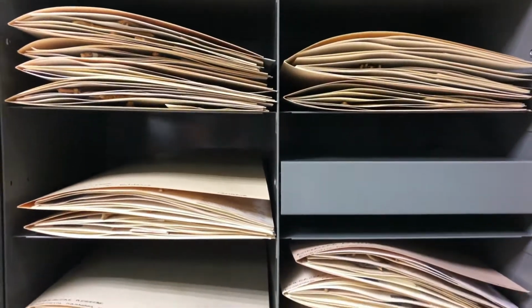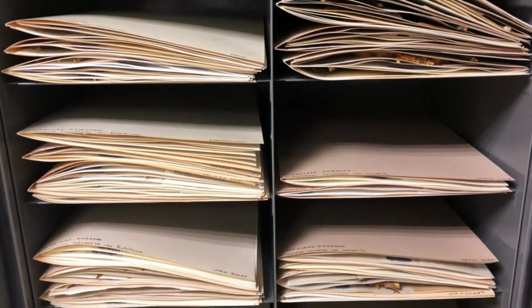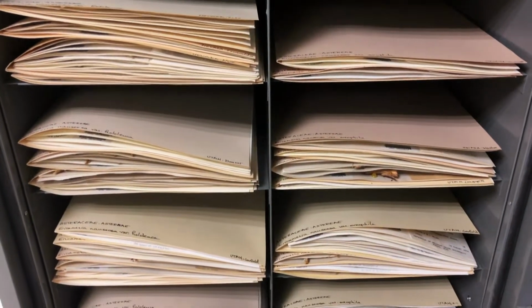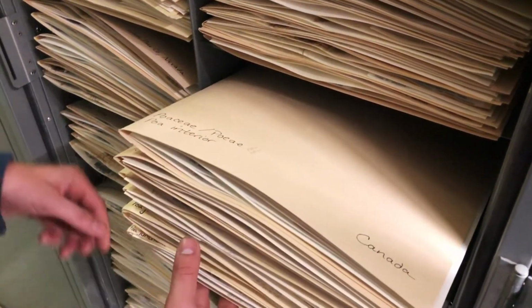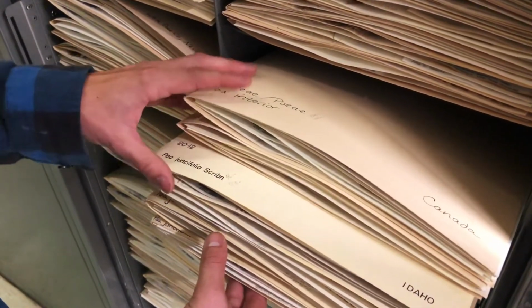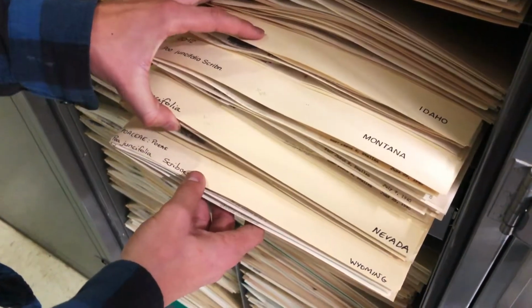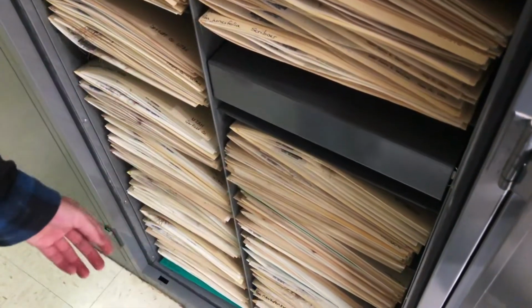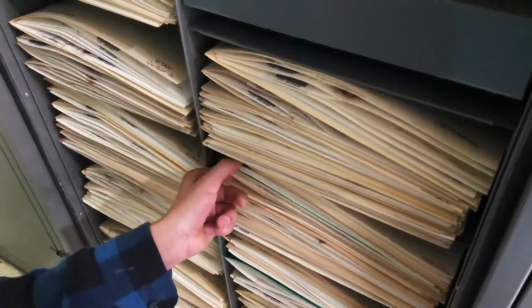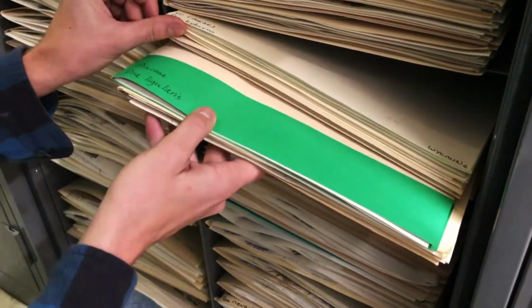The organization within each cabinet is, yes, through species. However, due to our collection being so wide, we break it up regionally, such as here you'll see Canada has its own, Idaho, Montana, and so on and so forth. For states that have more collections, we break it into county level. We also use color folders to differentiate which ones are cultivated or naturally occurring. Here we use green folders to signify that they are cultivated specimens.